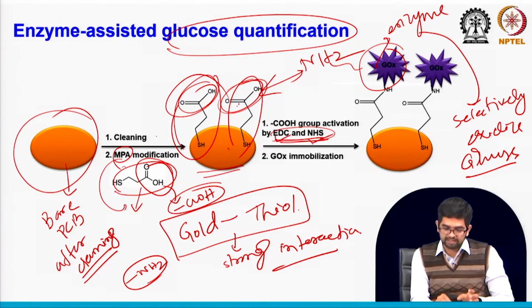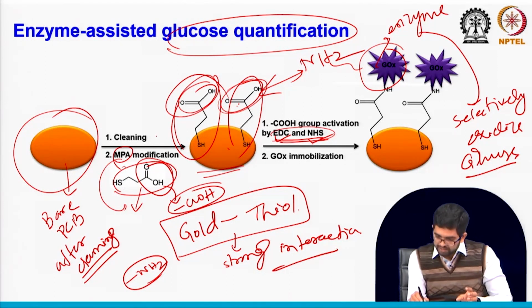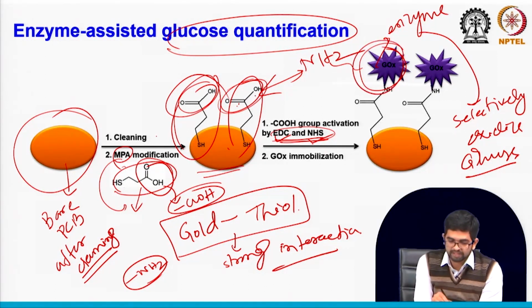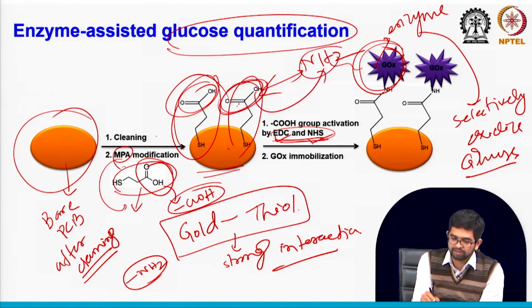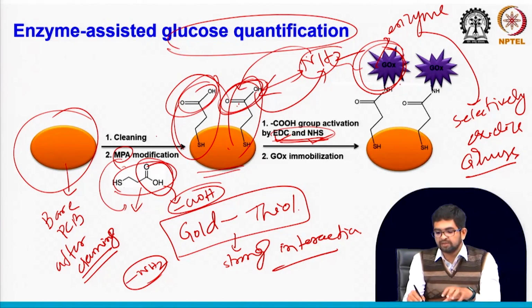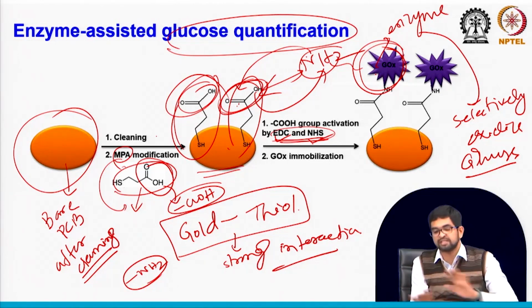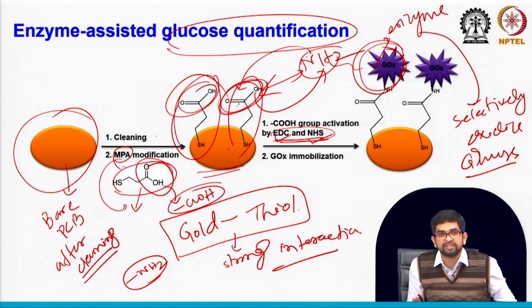They will activate the carboxylic group, and then the glucose oxidase will bind on the sensor surface. This activated carboxylic group will react with the amine group, or you can say the amine group will react with this activated carboxylic group, and then glucose oxidase will be attached on your sensor surface. So your sensor surface is now ready for glucose detection.